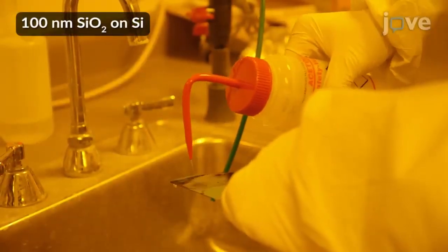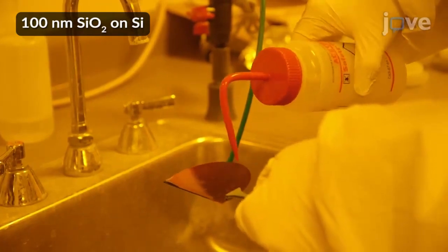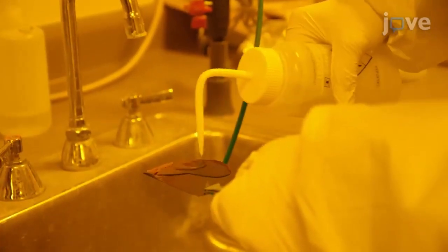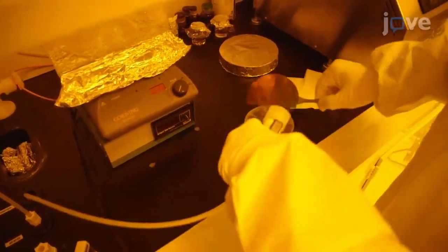First, clean a 100 nanometer silicon dioxide on silicon substrate using an acetone rinse, followed by an isopropyl alcohol rinse. Dry the substrate using a stream of nitrogen gas.